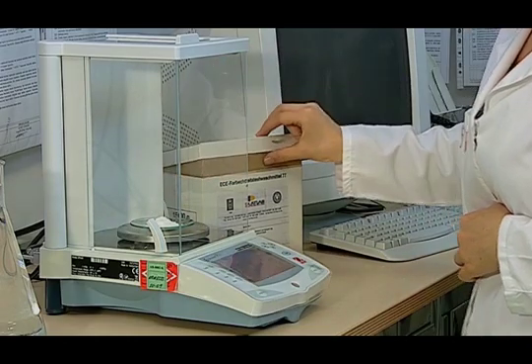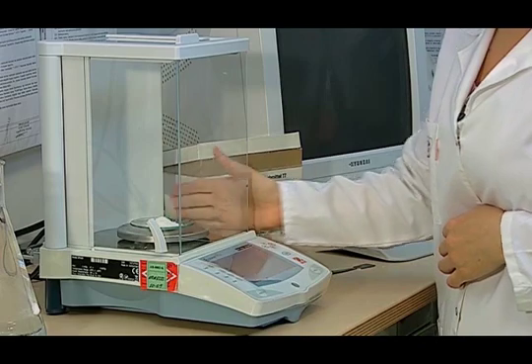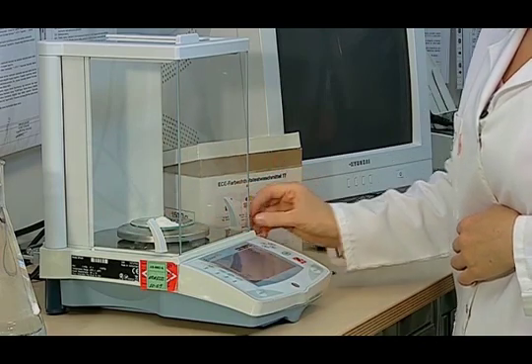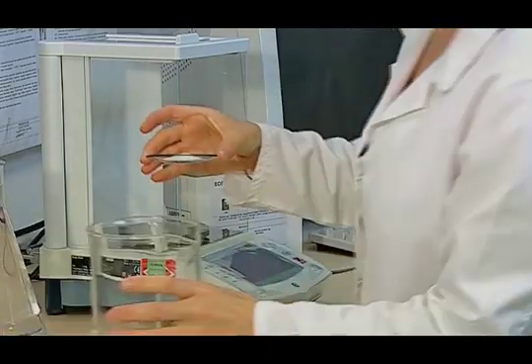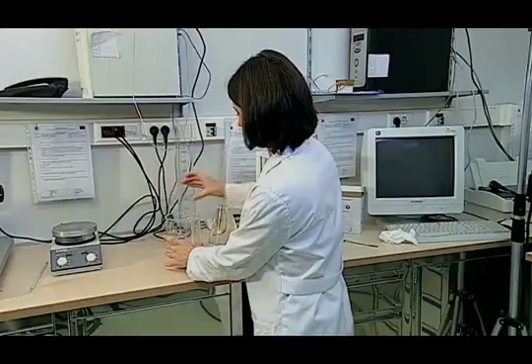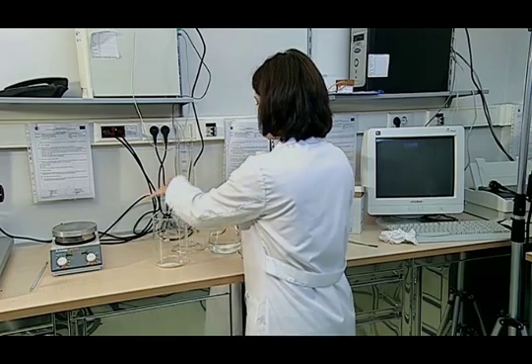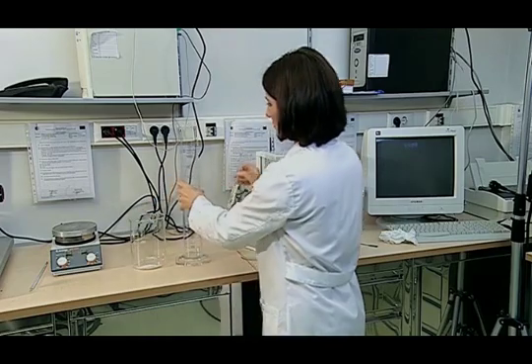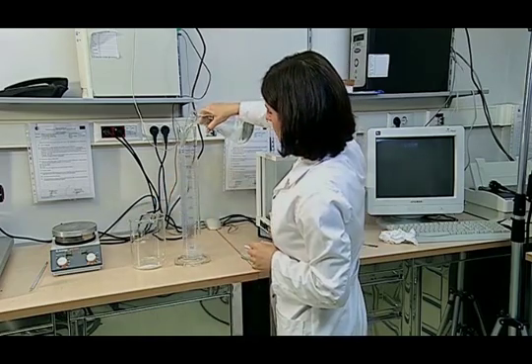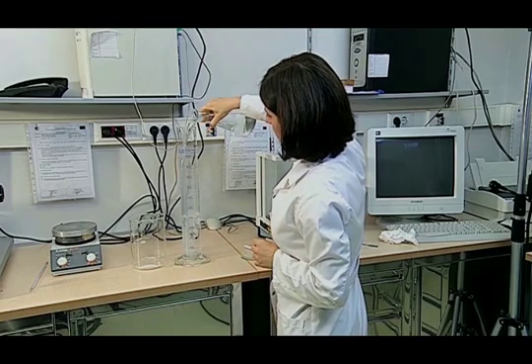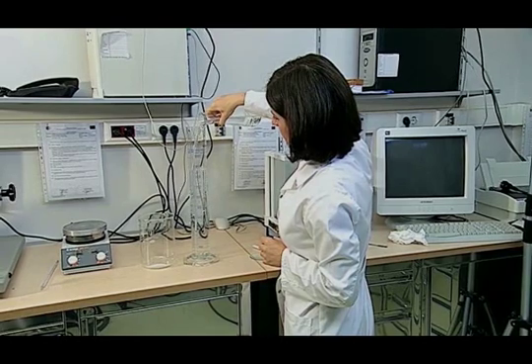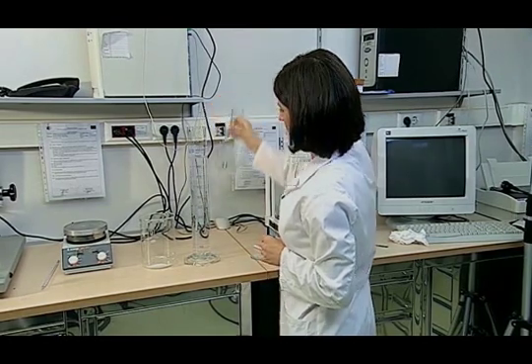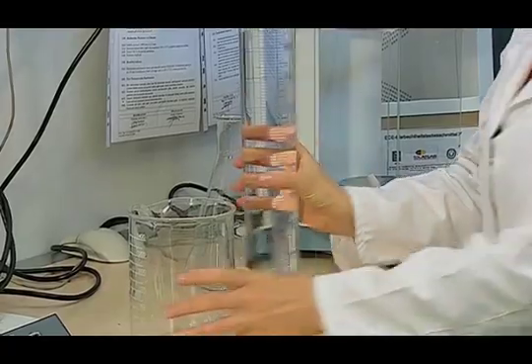After reading four grams on the screen, we pour the detergent into a clean beaker. Then one litre of pure water is measured with the graduated cylinder and poured over the detergent.